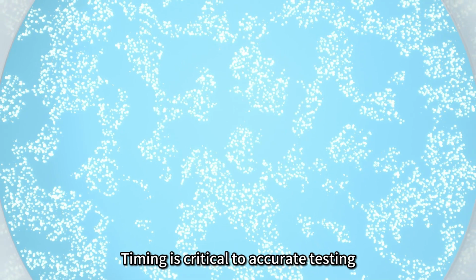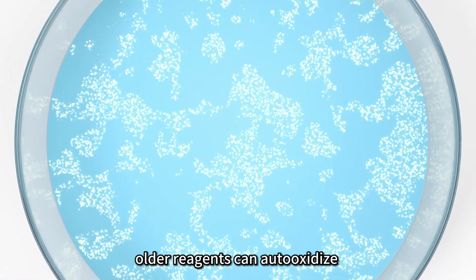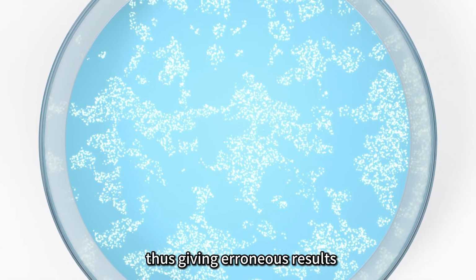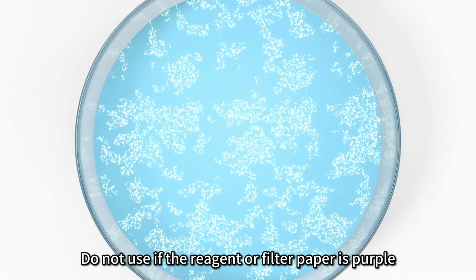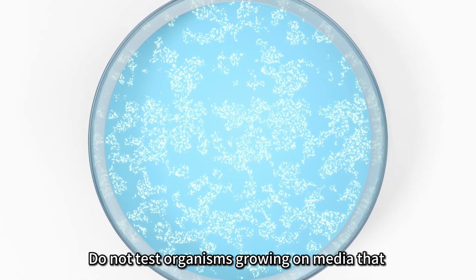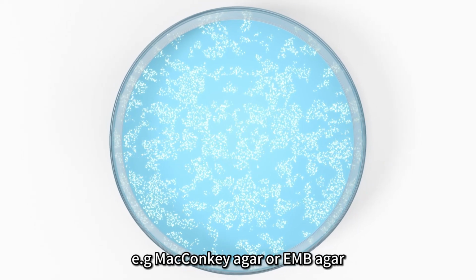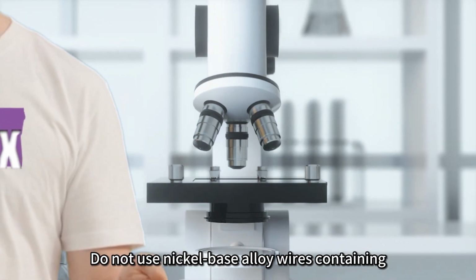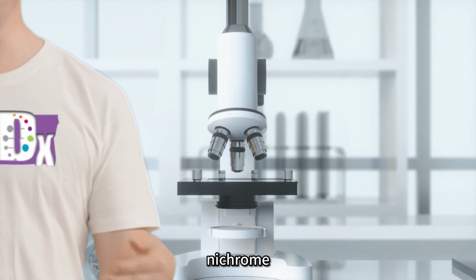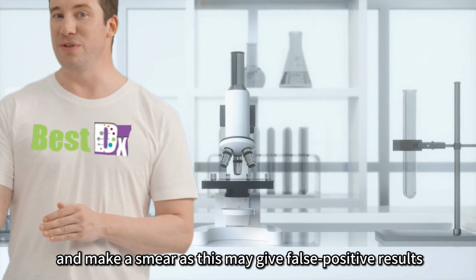Precautions and limitations. Timing is critical to accurate testing. Use fresh reagents, no older than 1 week. Older reagents can auto-oxidize, thus giving erroneous results. Do not use if the reagent or filter paper is purple. Do not test organisms growing on media that contain glucose or dyes, e.g. MacConkey agar or EMB agar. Do not use nickel-base alloy wires containing chromium and iron, nichrome, to pick the colony and make a smear, as this may give false positive results.